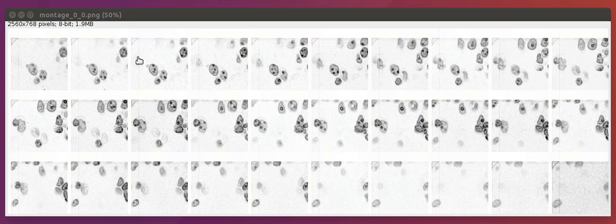What that means is that in every single frame where we identify this individual cell, we need to give that cell the same label. Looking at another example here, going from right to left, we see that there's a cell here, and as we go right to left, it'll become more and more in focus until it starts to diminish. Now again, this is the same cell, so we're going to give this cell the same label in all of these image stacks.